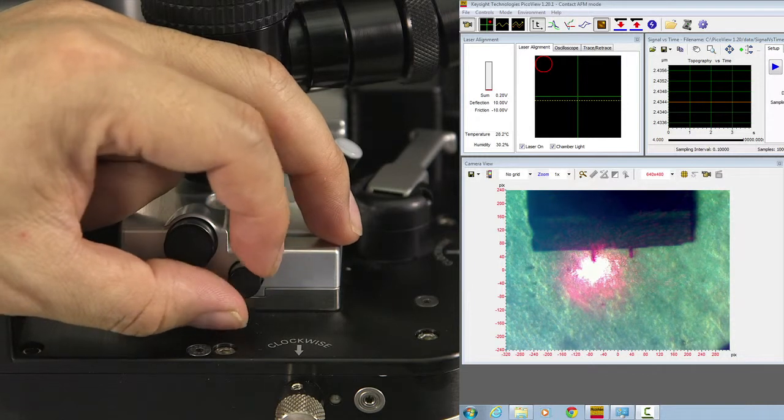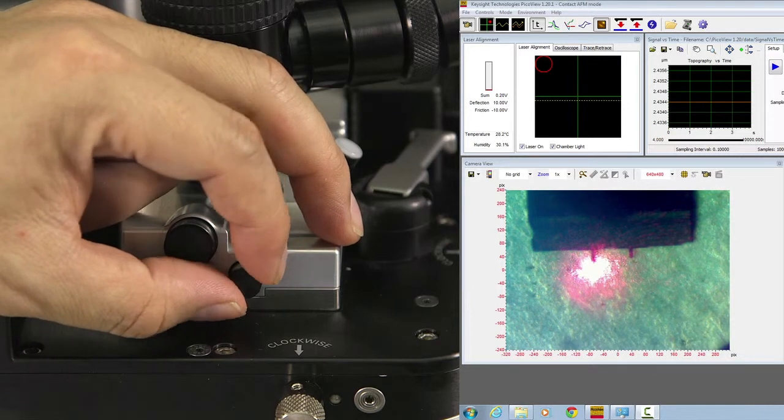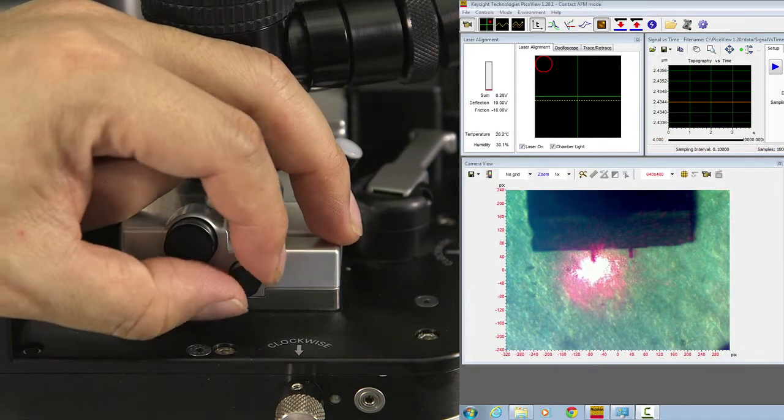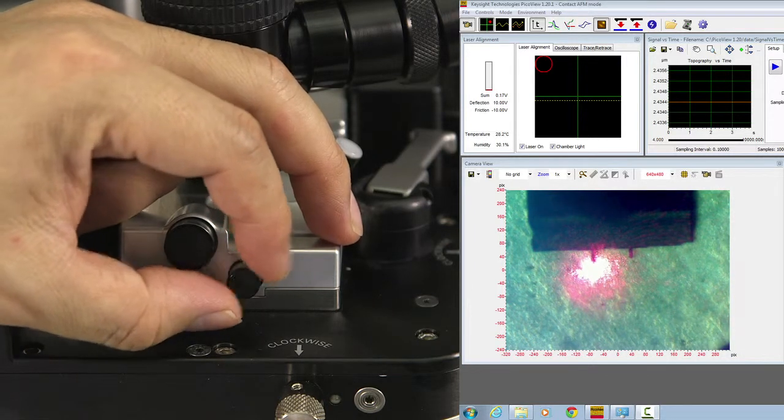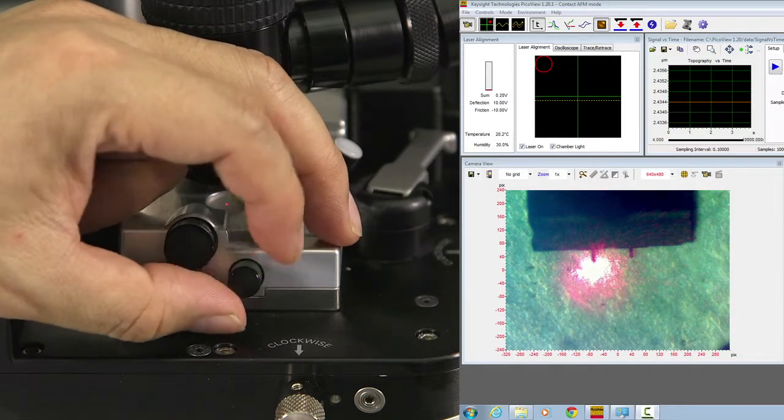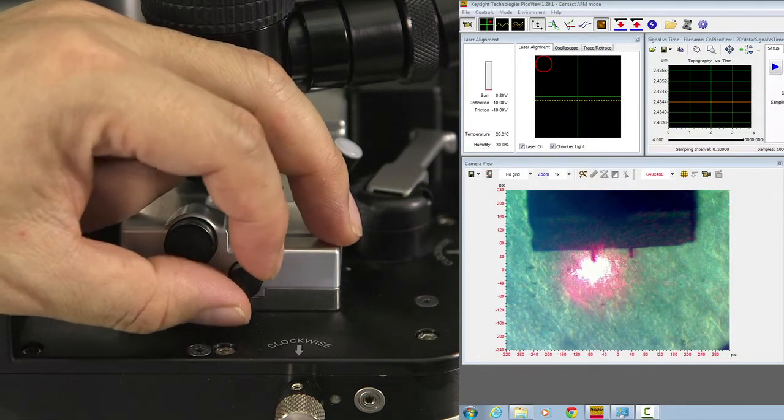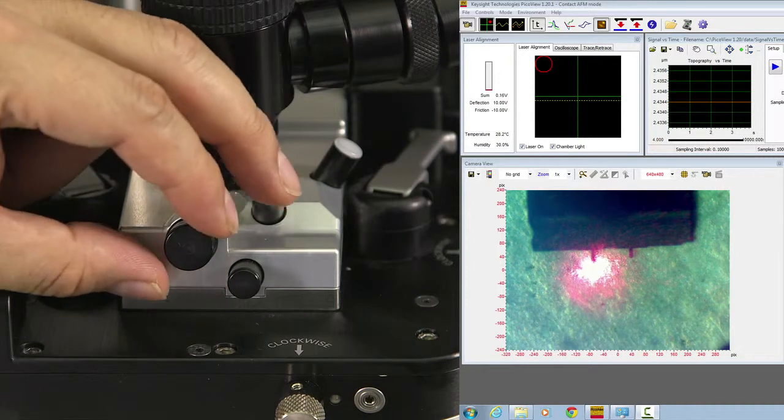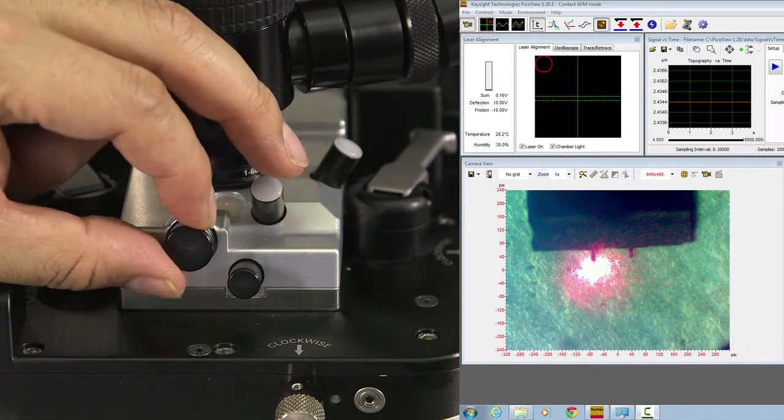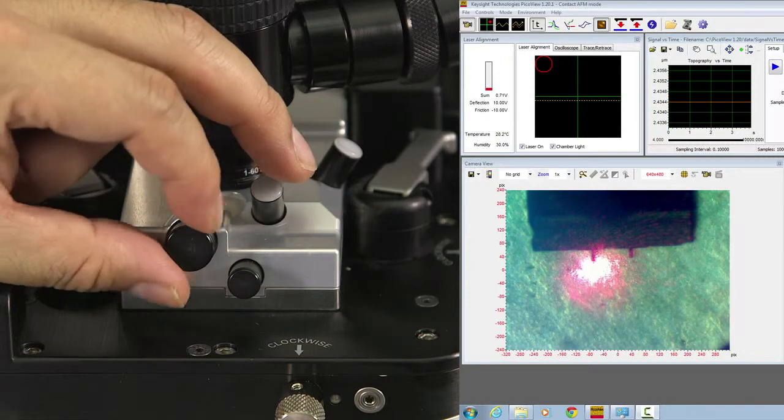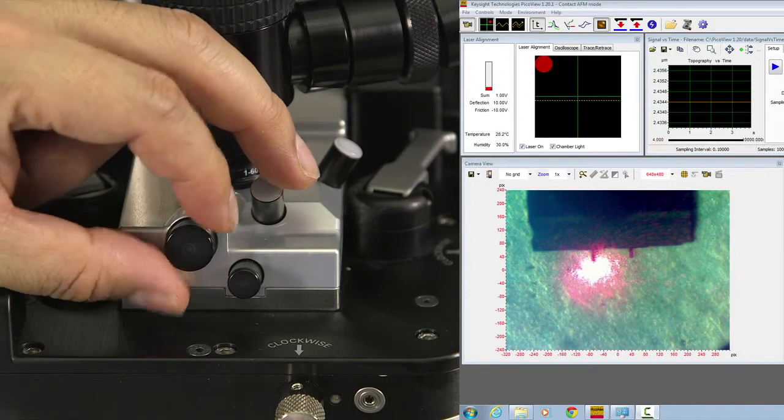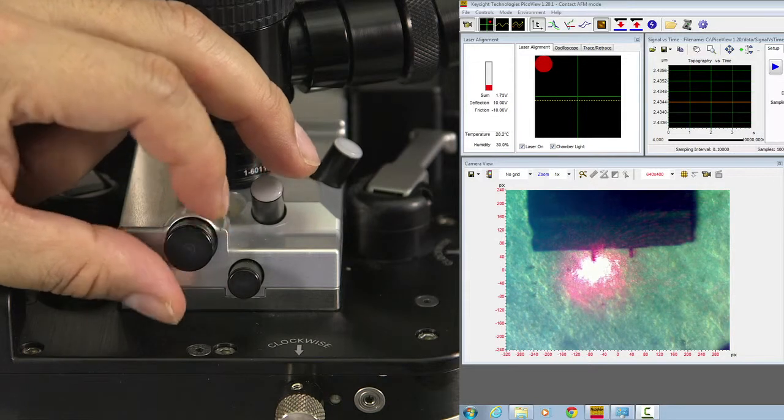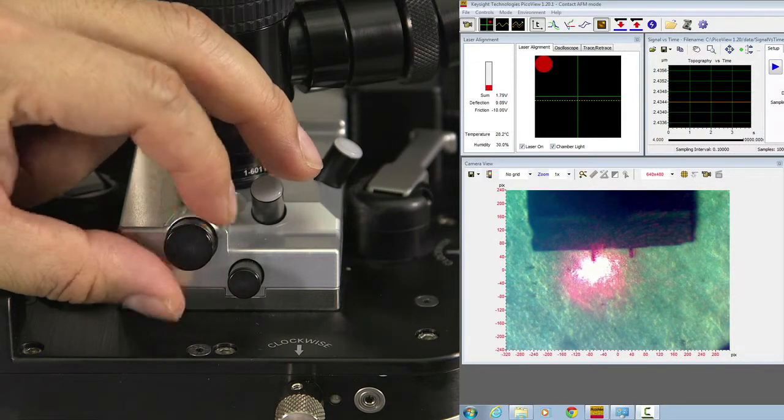Look at the sum signal. You should move the knob so the sum signal goes higher until it maximizes. Then you adjust the other knob also towards the direction that the sum signal goes to maximize.